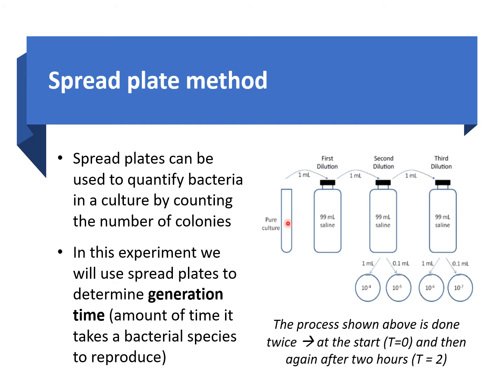After 2 hours, we pull the same tube and we repeat the whole process again. You pull that tube after 2 hours, dilute it one more time, and then inoculate some extra plates. That would be considered your T2.